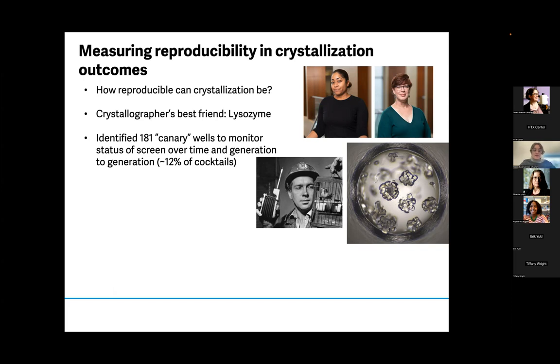So theoretically, if there was something systematically wrong with our screen, we should be able to not only identify that there's something wrong, but also go back to the plate and figure out exactly what might be happening. One tool that has been invaluable in this process is Marco Polo, which rapidly provides the outcomes list in CSV format.